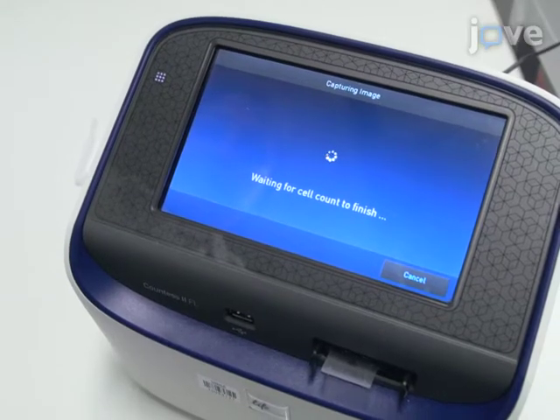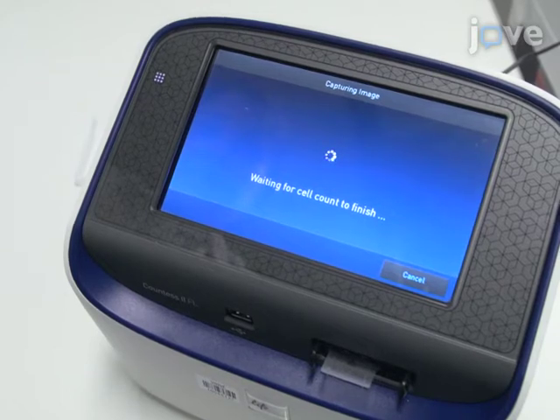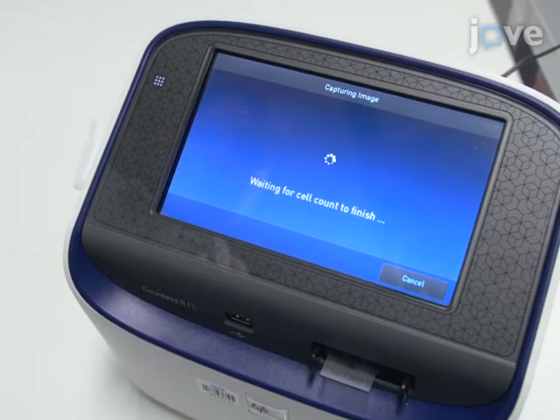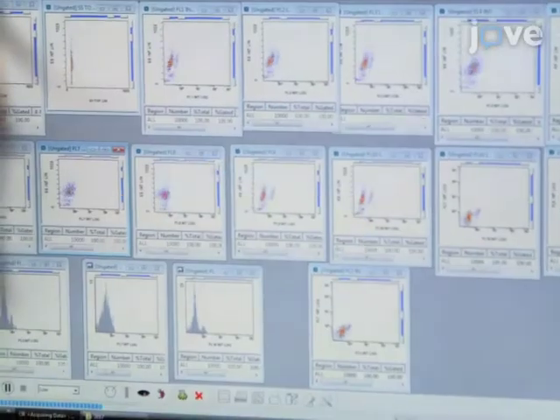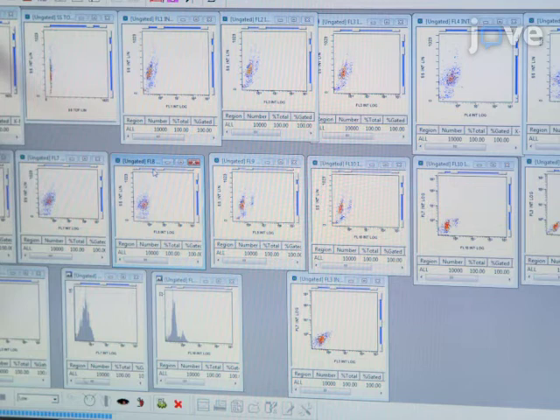Use B-cell specific antibodies such as anti-CD19, CD20, and CD45 to stain the cells. Using flow cytometry, gate the B cells derived from each organ with the CD19 positive, CD20 positive, and CD45 positive antibodies. Based on the gated cells, quantify the organ-specific engrafted tumor cells obtained from the mantle cell lymphoma injected mice.